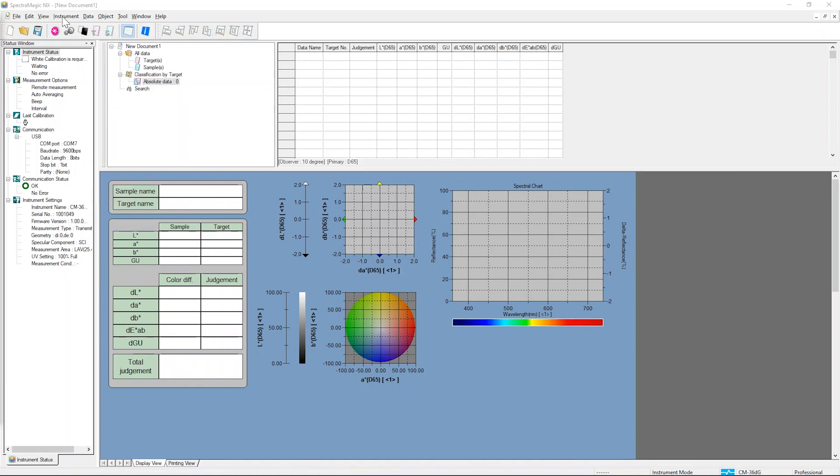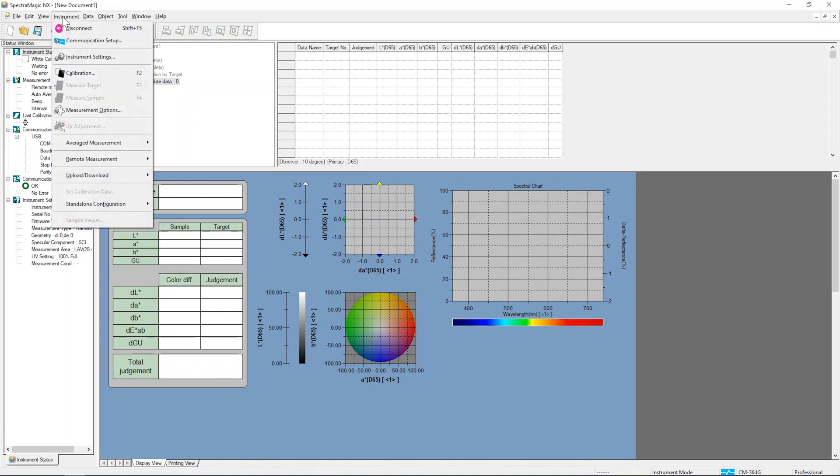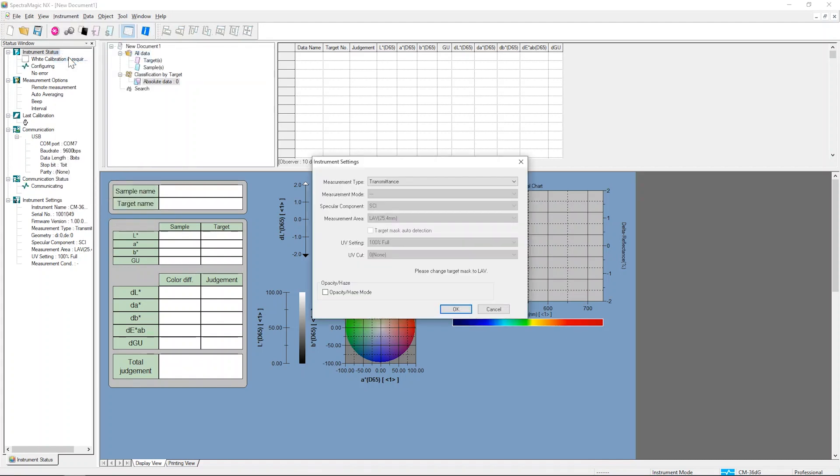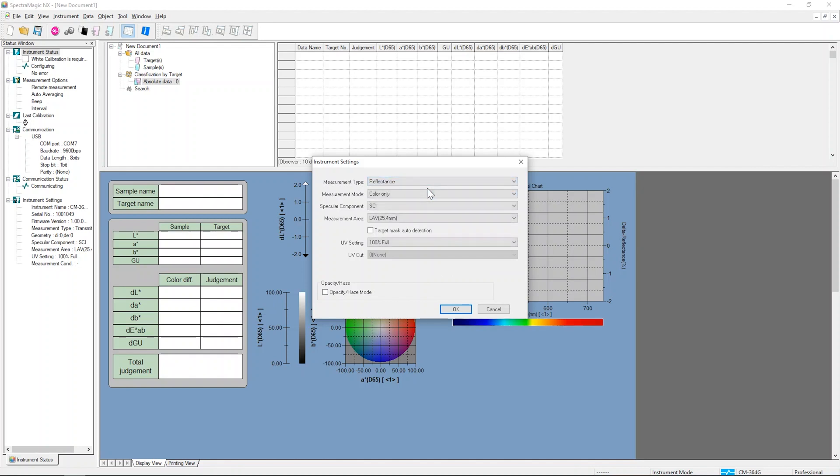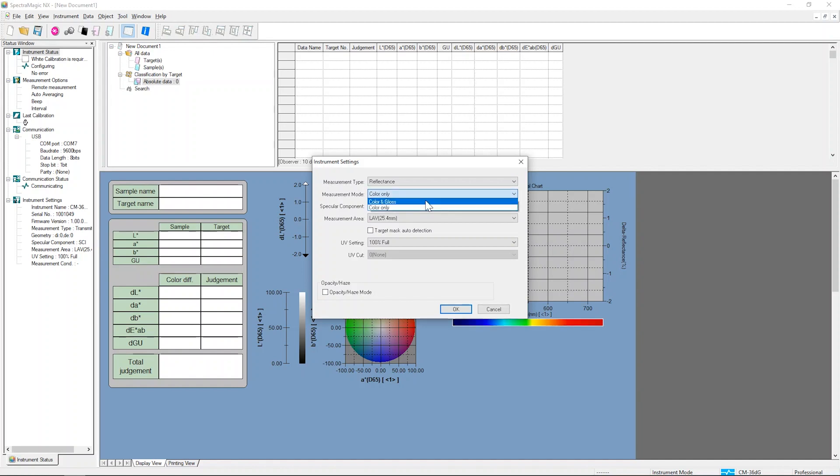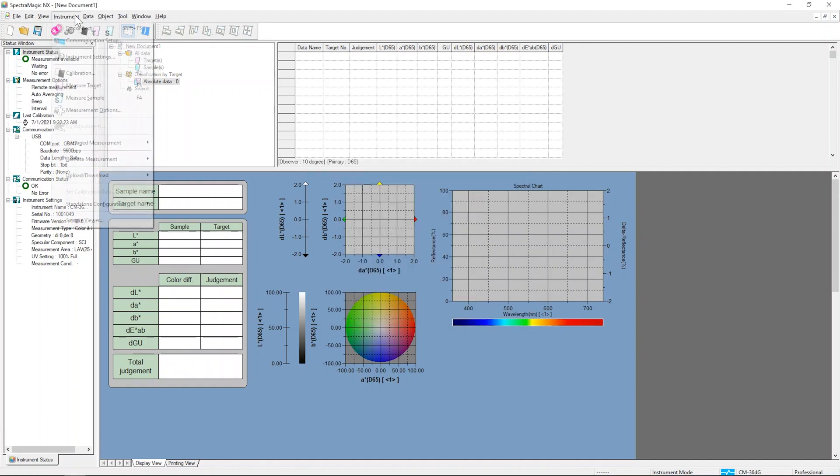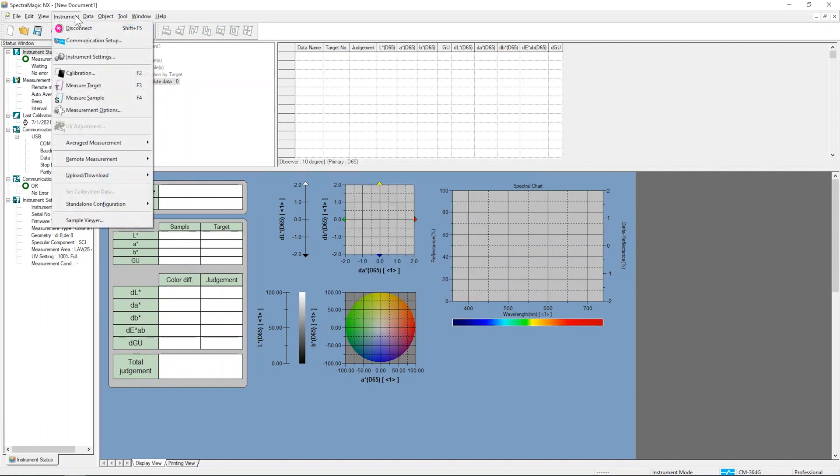Once the software is opened and communication is established, select the Instrument Measuring Mode, Color and Gloss as follows. Select Instrument Settings from the Instrument drop-down menu. Change the Measurement Type to Reflectance. Change the Measurement Mode to Color and Gloss. Click OK to confirm the settings.